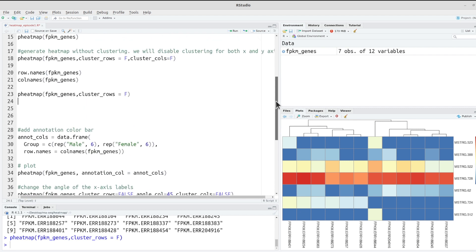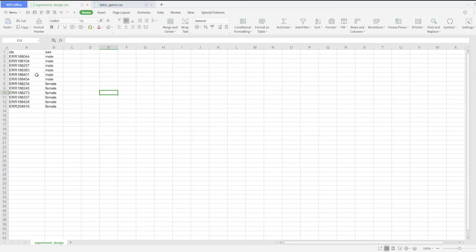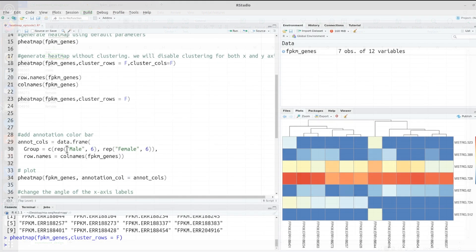Whenever you are performing clustering, it's likely that the arrangement of genes and samples may change. You may want to add additional information so that even if the arrangement changes, that information still helps you identify the groups. Let's check our experiment_design — we have the IDs, and each of these belongs to either the male group or the female group. Because clustering may change the order, you can add an annotation here so readers know which group each sample belongs to.